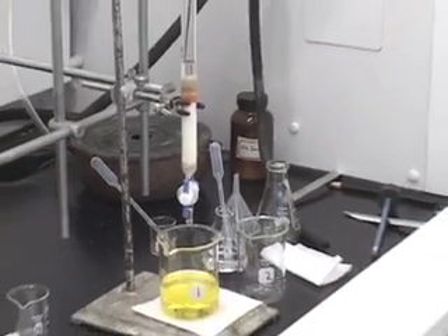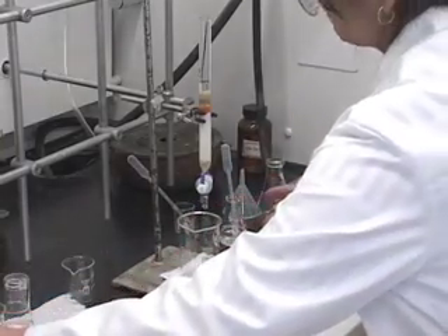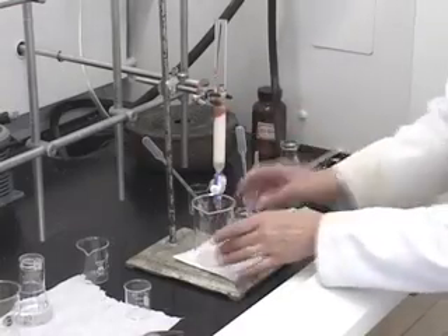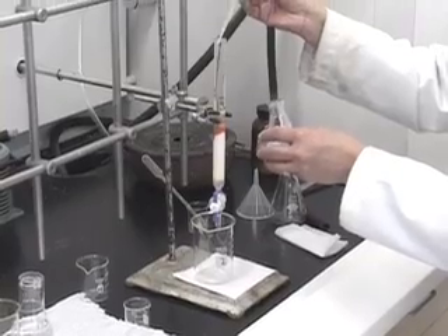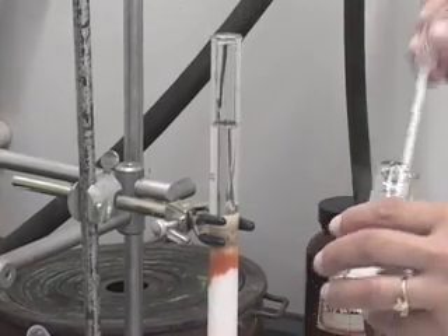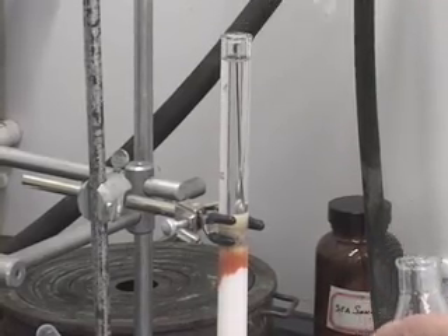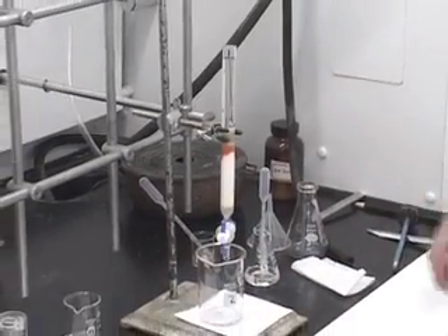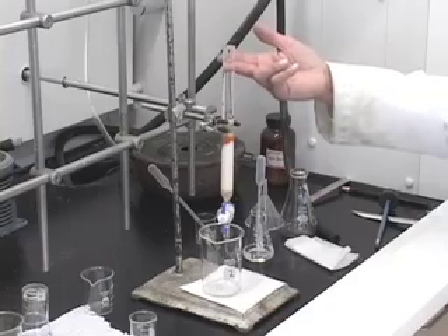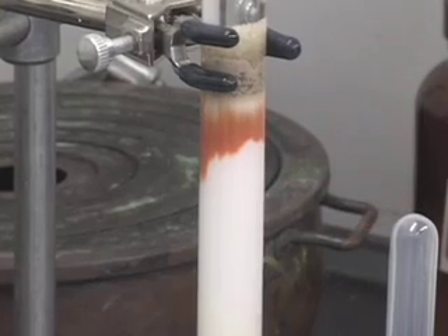We are almost ready to change the beaker. I am going to change the beaker to the intermediate fraction — make sure that the tip of the column is inside the beaker. Now let us fill the column with 10:1 hexane-ethyl acetate. You can already notice that the orange band has started to go down. It was not moving when we were eluting with only hexane, but now that the eluting solvent is 10:1 hexane-ethyl acetate, which is more polar, the orange component has started going down.